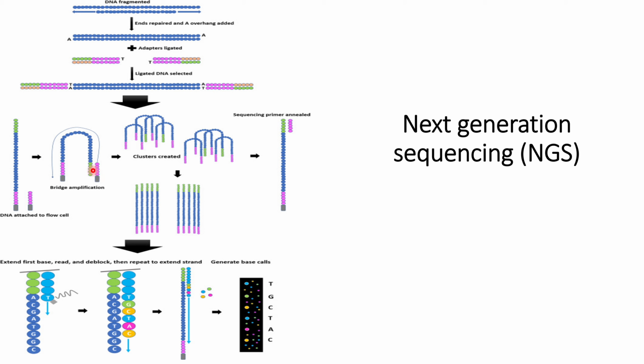So the primers will be added. Primers will bind to the oligos. Primers will bind to this top end, the other part of the flow cells to which this top end of the DNA fragment is bound. After that, the primer will help in amplification of the other end, or complementary part, of this DNA fragment, and this can be seen here. This cluster of bridge amplification occurs.